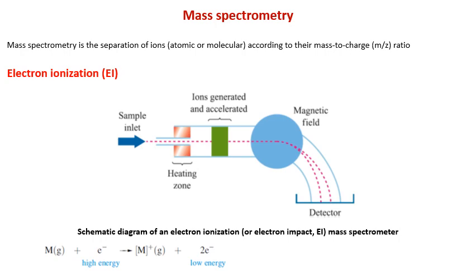One additional point is that the fragmentation pattern, the appearance of a mass spectrum, depends upon the natural occurrence of isotopes of the element. So the natural isotopes of the element give that pattern in the mass spectrum. The presence of several isotopes of an element leads to an observation in the mass spectrum, a pattern which is called the peak envelope. I will talk about this kind of peak envelope in the later part.